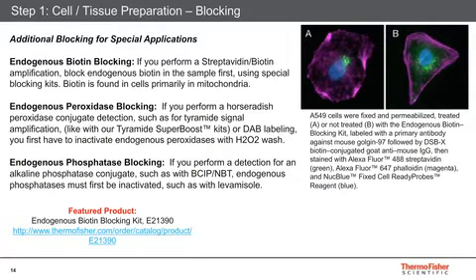And then in addition to the protein blocking and dye charge blocking, there are some specialized techniques that require their own blocking steps as well. It's very common to use a streptavidin biotin amplification, and I'll talk more about amplification techniques in a minute. But if you use streptavidin biotin, you want to block the endogenous biotin in your cells or tissue first. Otherwise, you'll be labeling that as well, confusing your signal.